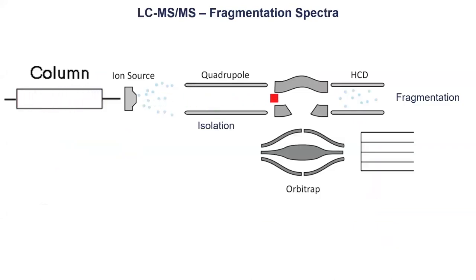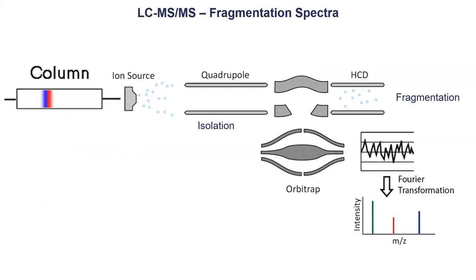And also in an Orbitrap, of course, we can do fragmentation experiments, which is only possible in a targeted way if we have a quadrupole before, what we already talked about. So here we can set a specific mass to charge ratio that we actually want to have. And then based on this, we have a mass that we know, and then we can acquire fragmentation data.